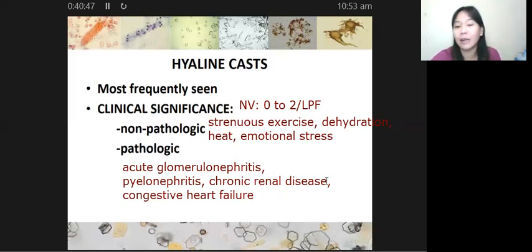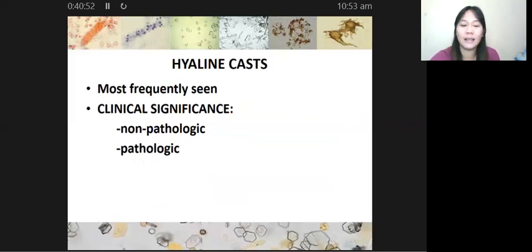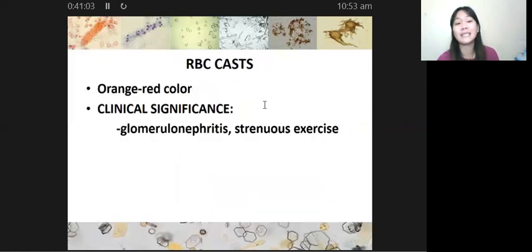Okay, so, ayan. Alright, so punta na tayo sa next. So we have your hyaline casts. Ayan. So medyo mahirap talaga siyang i-identify under the microscope. Alright, so the next cast, we have your Rbc casts. Okay, so for your Rbc casts, let us try to remember kung ano ba ang significance ng ating mga RBCs. Okay? Kasi, syempre, kailangan sila in the formation of your casts.